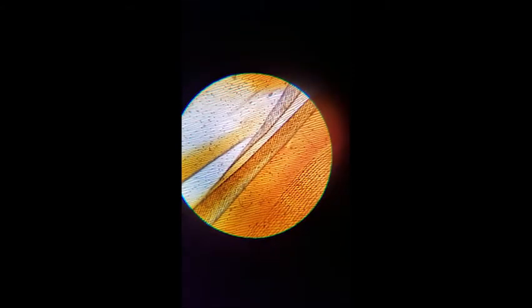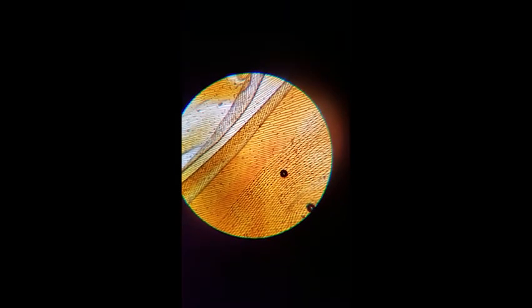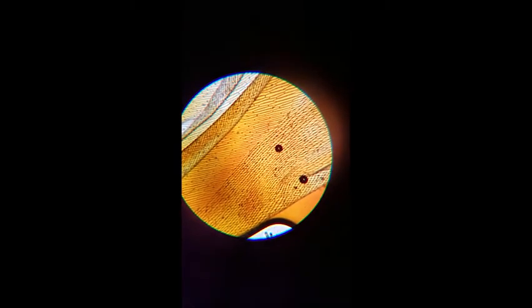It's important to remember to adjust the light intensity and the iris diaphragm for better contrast in viewing the cell. With the slide on the stage of the microscope, add a drop of iodine to one side of the cover slip. Place a small piece of paper towel at the opposite edge to draw the stain under the cover slip.